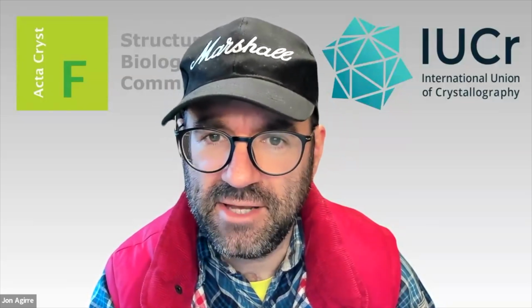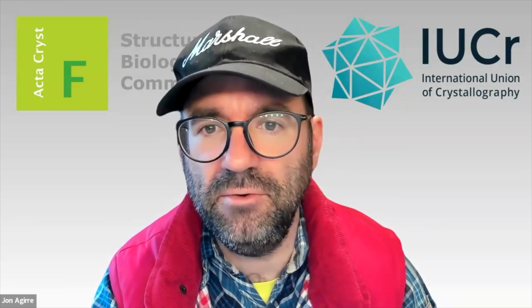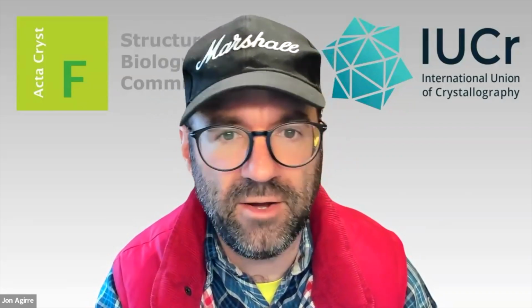This Acta Cryst publication is a paper on small angle X-ray scattering, SEC-SAXS, of macromolecules. How do you see the future role of SAXS studies in structural biology and crystallography? But also, how can SAXS contribute to the sample quality in cryo-electron microscopy?